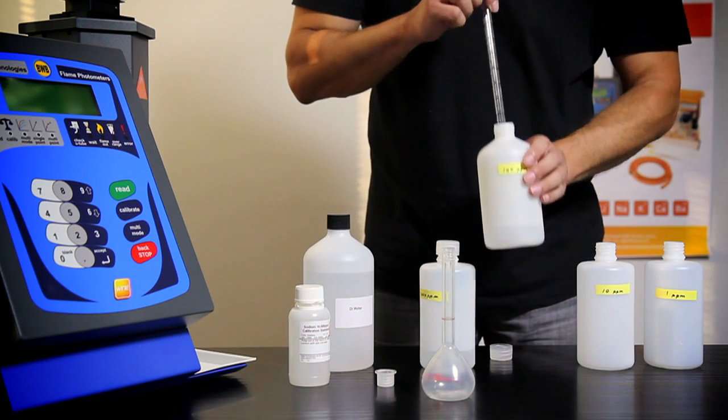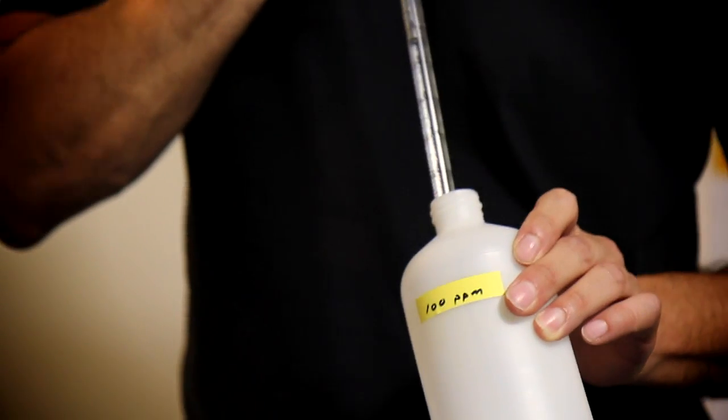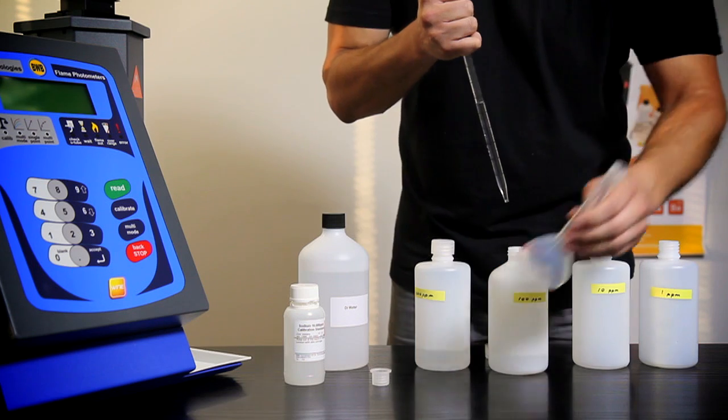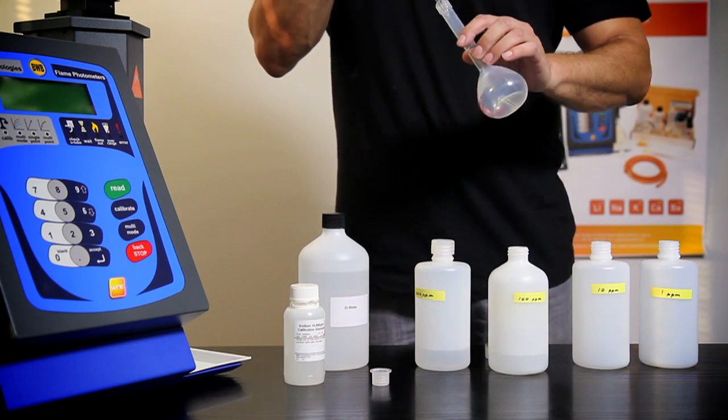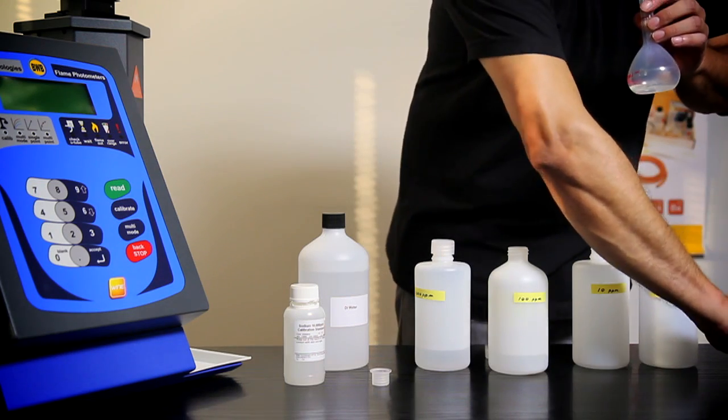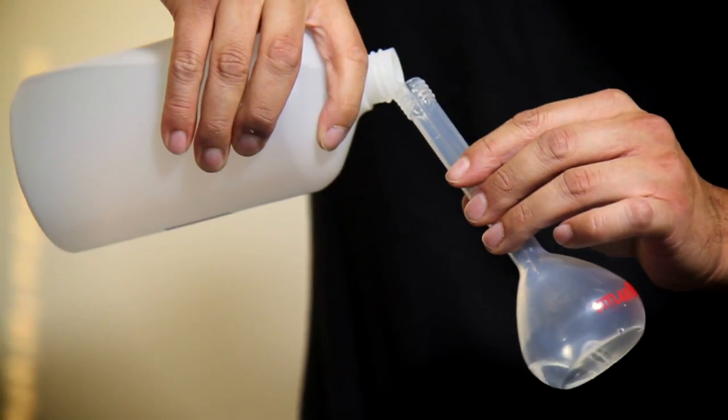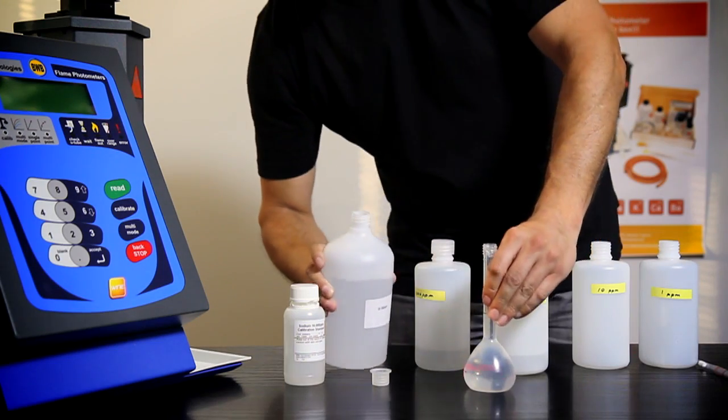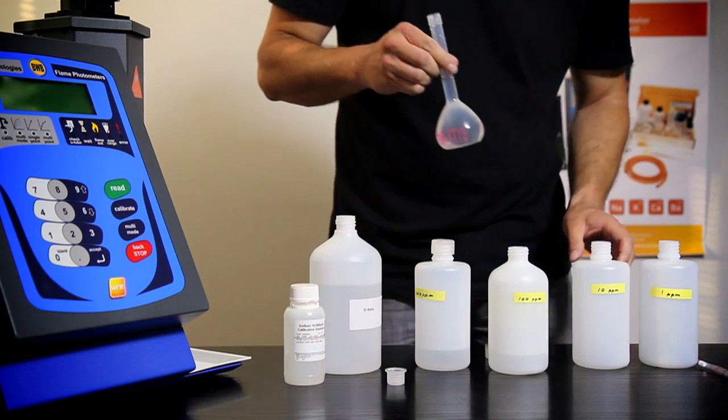For our third solution, measure out 10 ml of your 100 ppm standard using your pipette. Repeat the dilution as before. Pour into the third beaker and stir to form your 10 ppm standard.